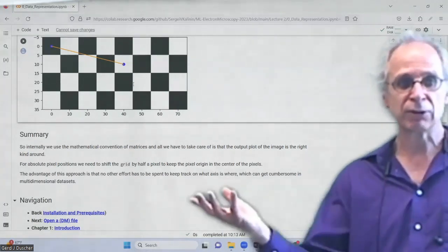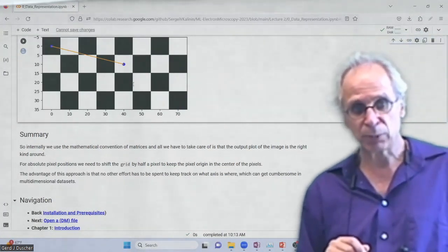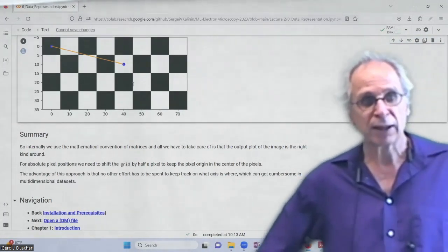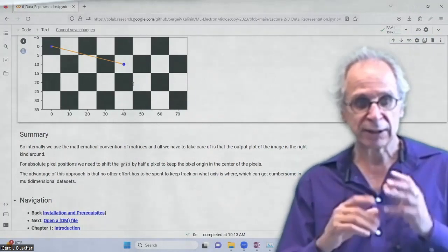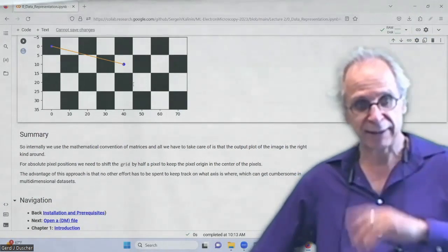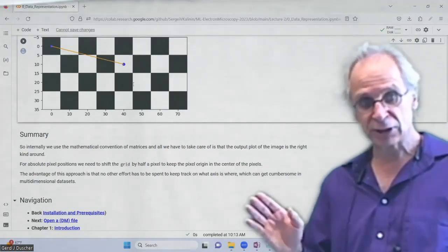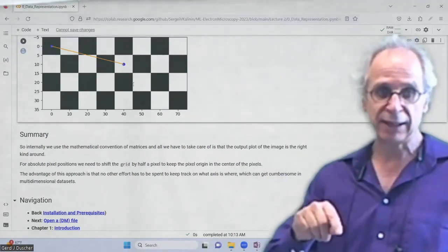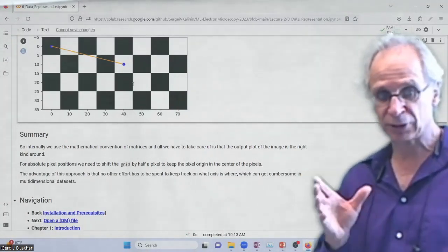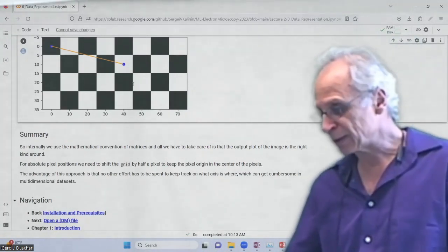For plotting, we transform the image, and that is the way to have the least confusion, and it preserves the order of fast and slow scans. If we are not consistent in any of these cases, tell us, because we definitely want to know and fix that. So consistency is, of course, important. We'll talk about that in the next one.